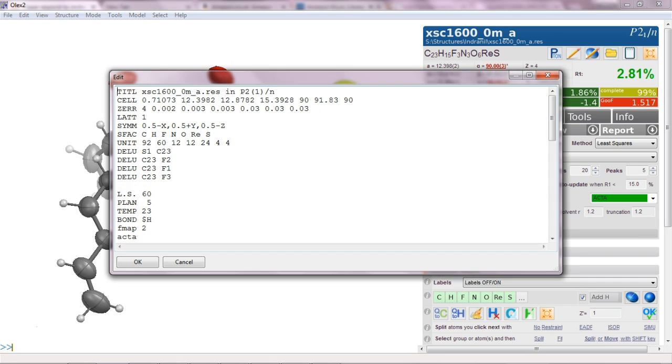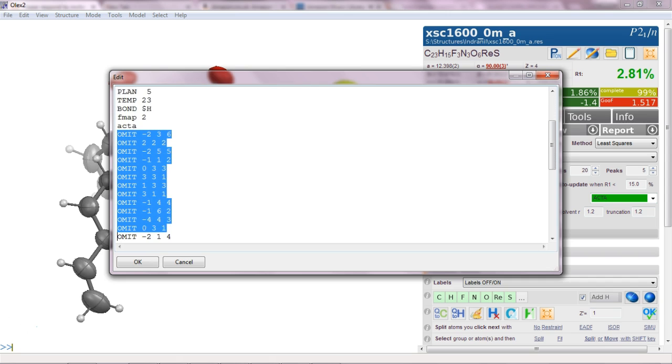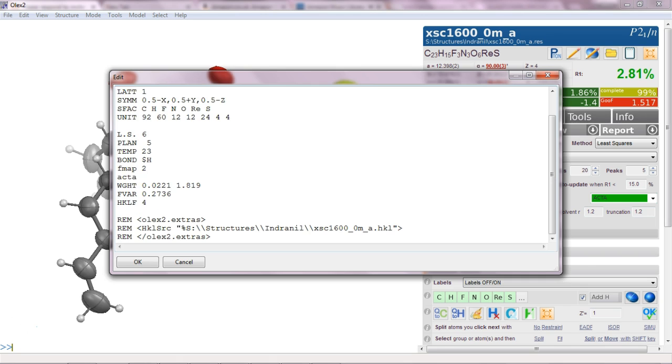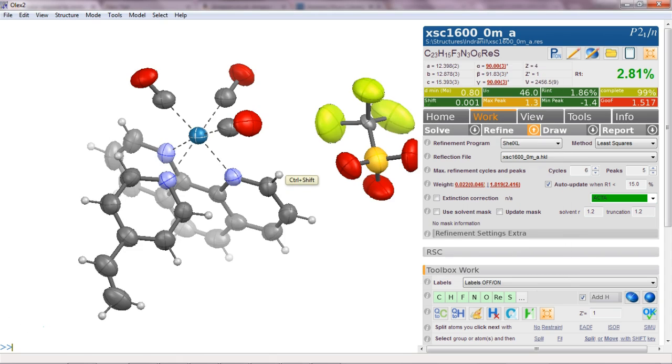What's in the files? Okay we've got a lot of DELUs. Let's just get rid of them. This is also an LS60. Well actually if it doesn't settle after about six cycles then there's something wrong. So LS6 is probably what we want. We've got OMIT, a lot of them. Okay let's get rid of all of them for the moment. And now we should have a fairly clean starting point to this structure.